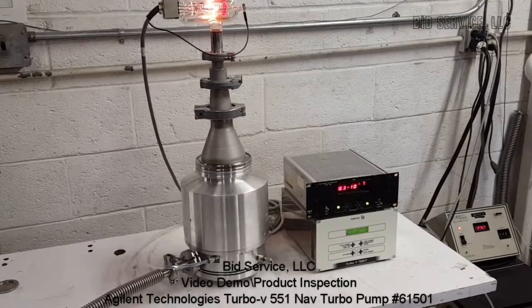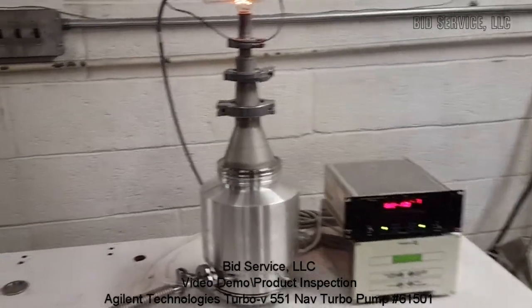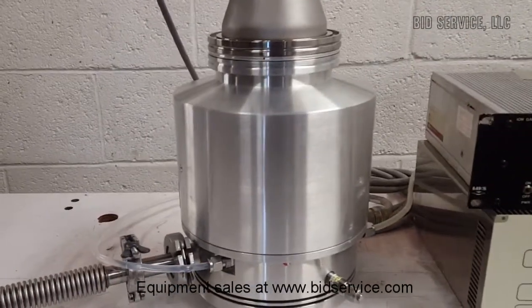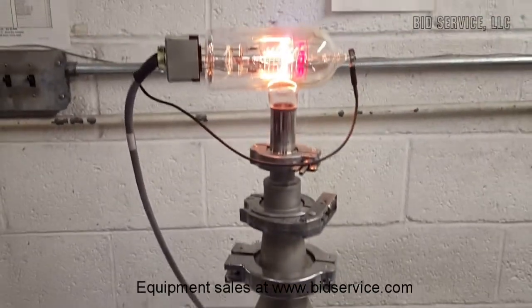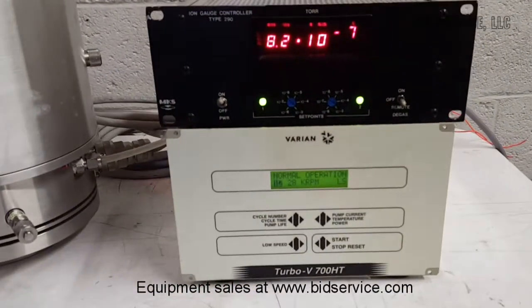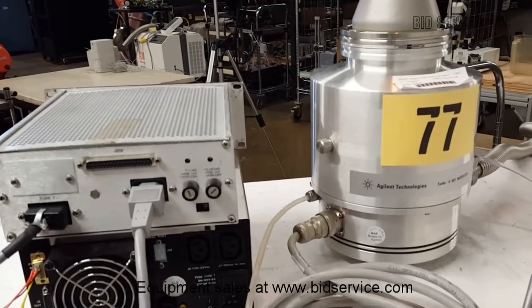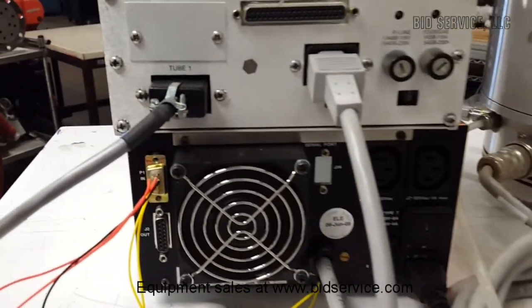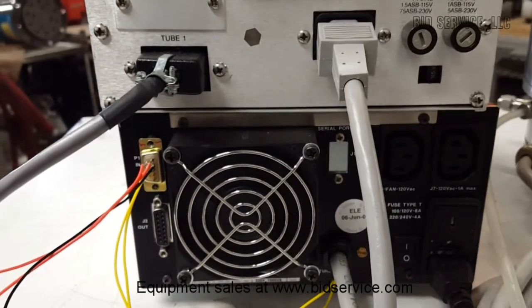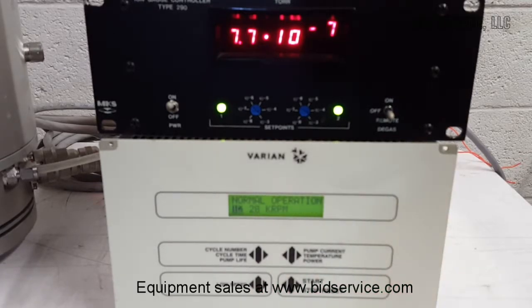Here's the Agilent Technologies Turbo V551 Navigator. Right now it's running at low speed. Now I just turned it on to the maximum RPM.